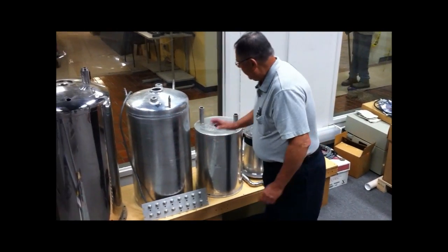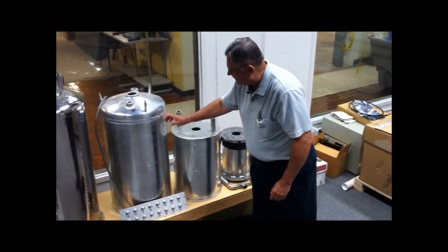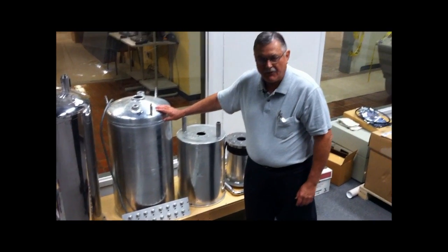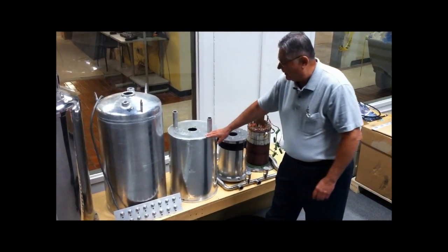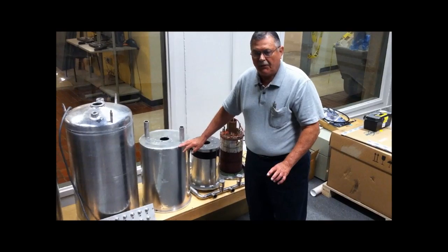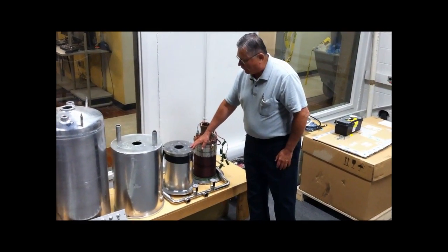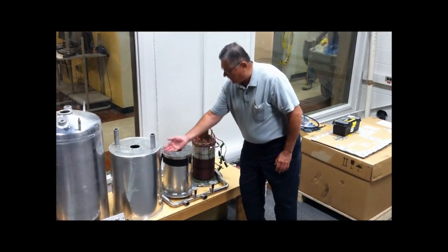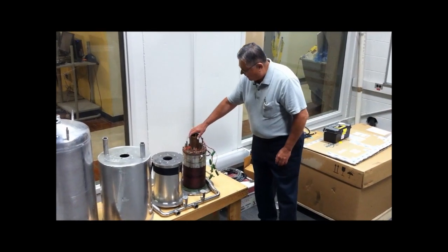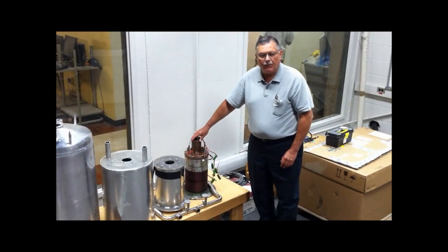This is then inserted in there. This can holds a magnet, and in the space where this can is located, it's filled with liquid nitrogen. Inside of this can is filled with liquid helium, at a much lower temperature, and there is an outer shield for the magnet here which is inserted in there. And inside this shield, we have our magnet that is wound with miles and miles of superconducting wire.